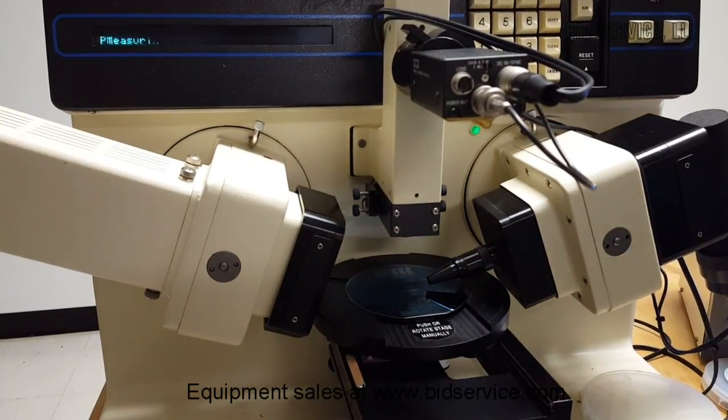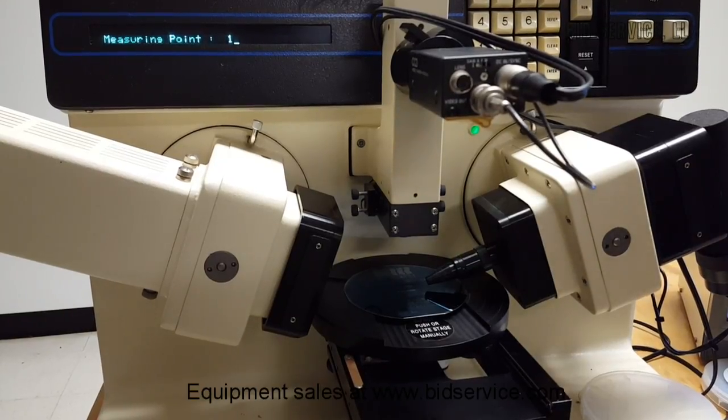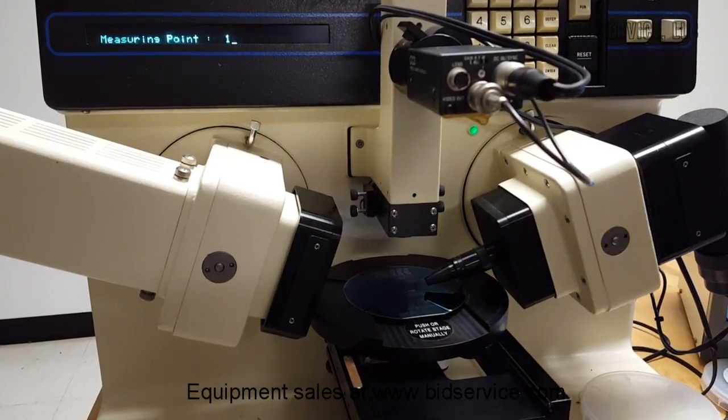While adjusting the height, care should be taken that the beam bounces off the sample and passes through the nose piece here, through the center of it.